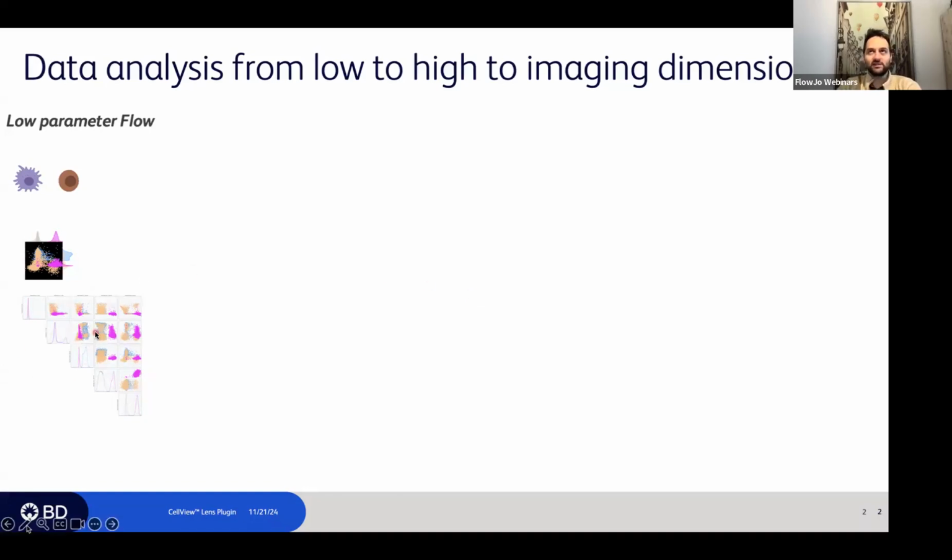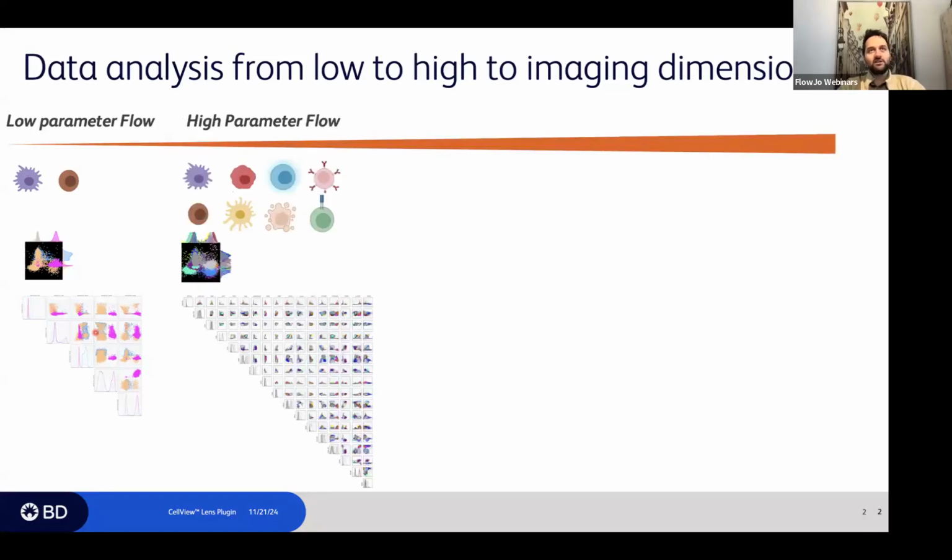In FlowJo, this task is quite easy. If you're familiar with FlowJo, you can place your gates, overlay populations, have a gating strategy, copy it to the group, and export all statistics and graphs you might need. Of course, with the advancement of cytometry and new, more precise spectral instruments, we can now identify many different immune cell subsets within our samples, so we can use more markers.